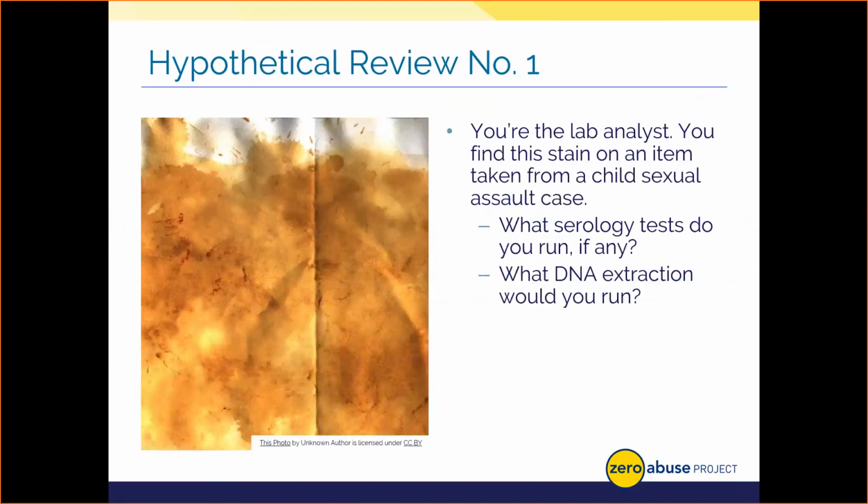All right, let's look at some engagement-based learning here. Let's go ahead and test some of what we've learned. You're the lab analyst in this case. You find this stain here before you on an item taken from a child sex abuse case. Assume you're going in using sequential examining techniques that we talked of at the beginning of the session, where you're only using just that basic information of the case type, and you know the stain features from our lecture today, right? And your knowledge of what stains look like to guide you.